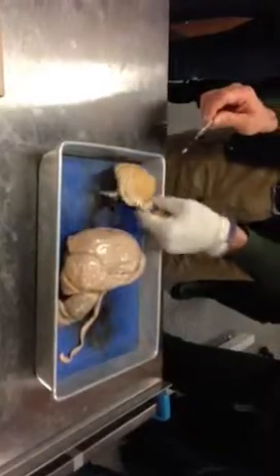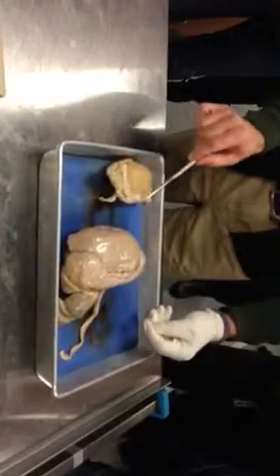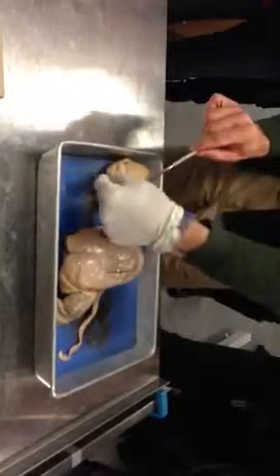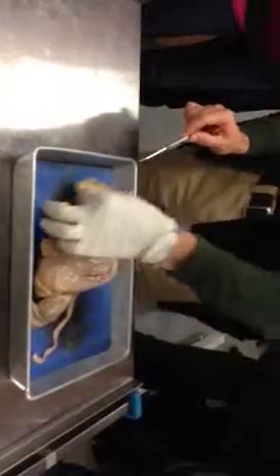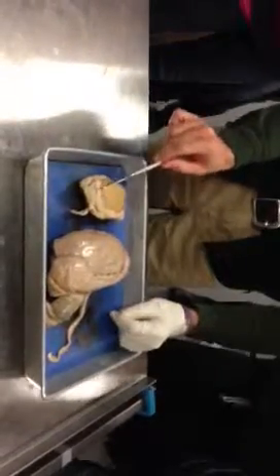Okay, on the sheep testicle, here's the epididymis. The head is towards the top. This would be the spermatic cord. Okay, so this would be the head.